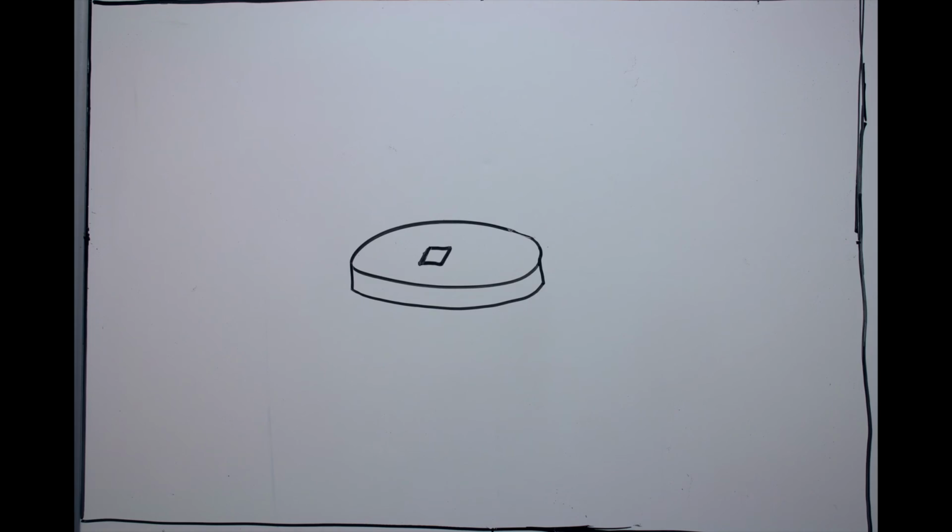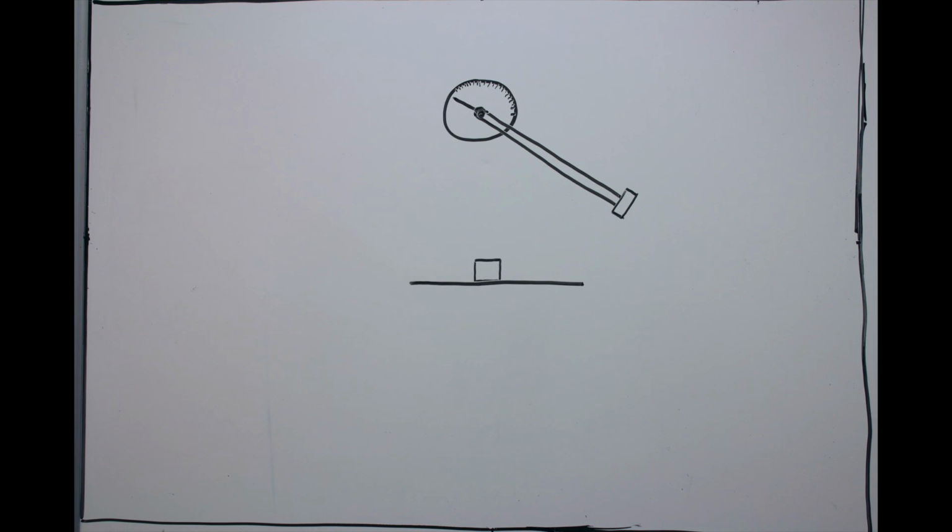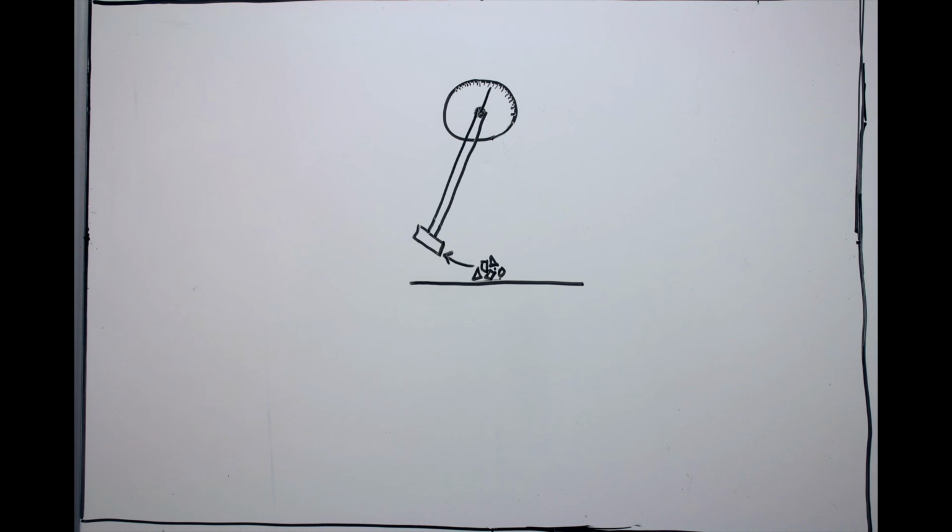A material's hardness is measured by determining its resistance to penetration and indicates how easily a material can be machined, how well the material will wear, and if treatments and coatings may be needed for the performance desired. Material impact strength is determined by fracturing a notched specimen and measuring the amount of energy absorbed by the material during fracture.